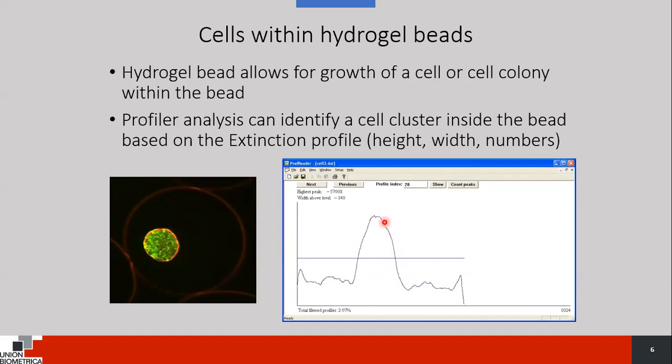And this measurement that you see here is for the optical density, but you can also get the same measurement for fluorescence, in all of the fluorescence that you're measuring. So there could be like 3 colors of fluorescence, and that greatly increases the number of measured parameters for each object and increases the information density for each object.